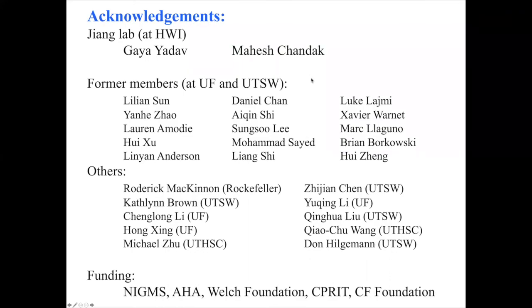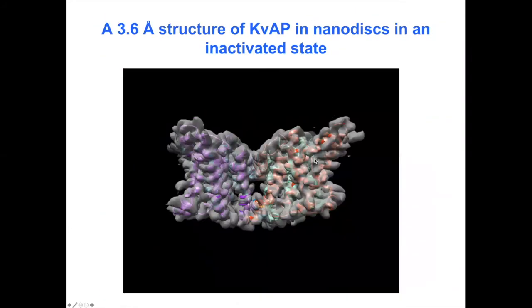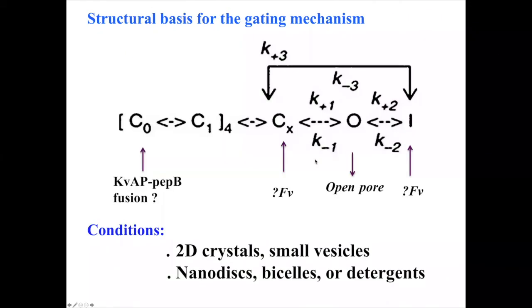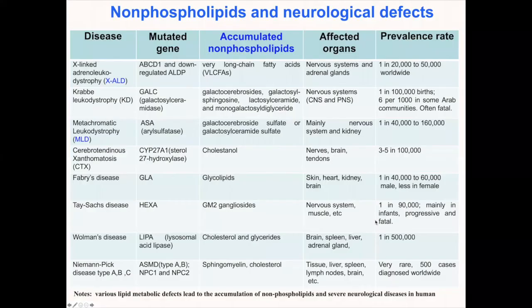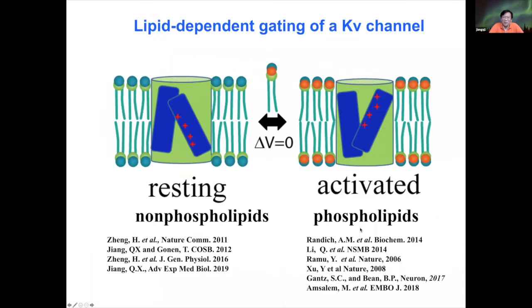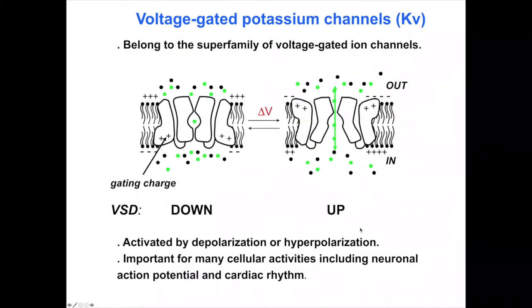I had a small question about your project 3, where you said that based on the observations, you concluded that it might be C3, the physiologically relevant form of this filament. I remember you showing data that said C3 usually forms when the conditions are high salt. Yes, high salt is around 150 to 200 millimolar, which is physiological. That is exactly what I wanted to know, how relevant it is when you compare it to the biological salt conditions.